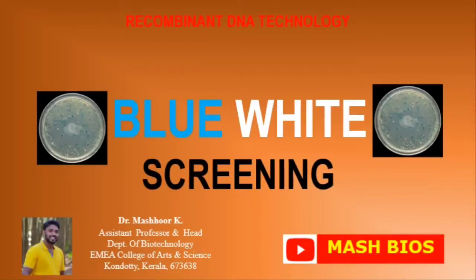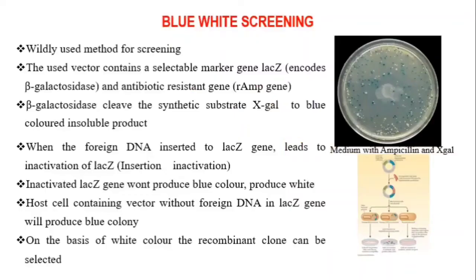Today we are going to discuss blue-white screening. The next method is the blue-white screening method. This method is widely used for screening of recombinant clones.